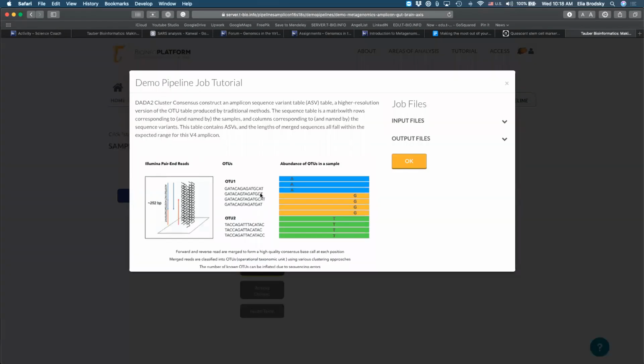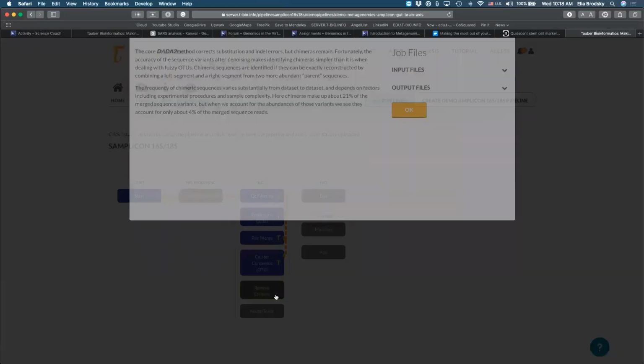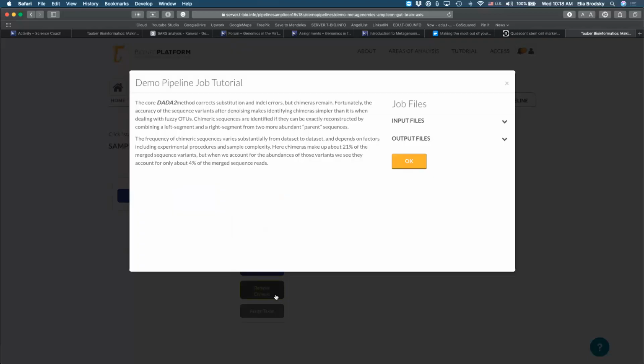and we can prepare the operational taxonomic units. Remember, those operational taxonomic units have very small variation within a group. So that unit might include small variations that are insignificant. That way we can reduce the number of individual types of units that we are reading in our whole data. Sometimes reads will include a starting point of one and the end point of another actual biological sequence, and those are called chimeric sequences. They combine elements from different biological sequence samples, and so we want to reduce those.